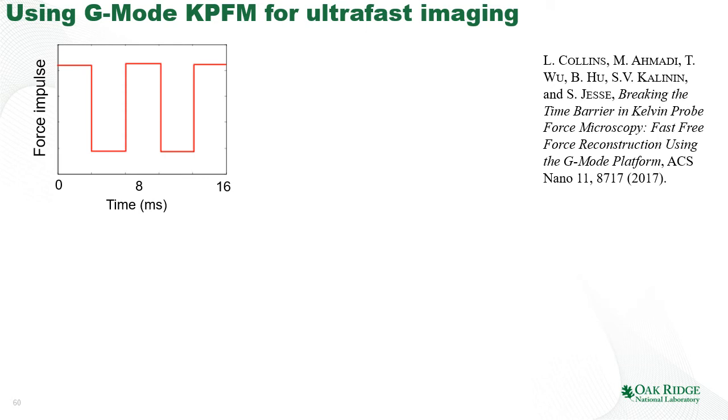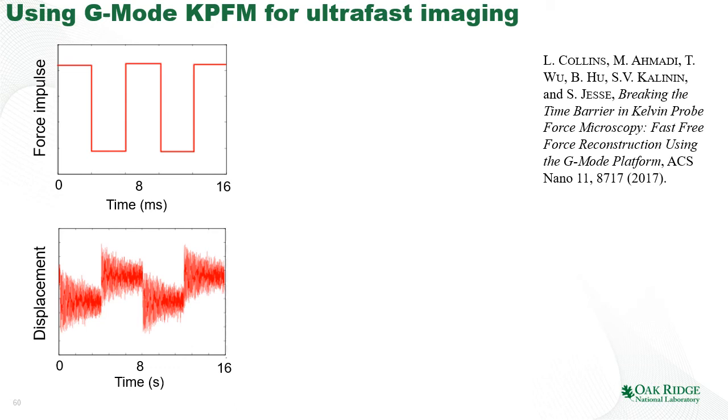And the reason why we want to do that is that in many material systems, it is the time responses that are ultimately interesting. And the problem is, why can we not measure it in the usual KPFM measurement? The answer is because of the cantilever ringing. So if our force pulse applied to the tip looks like this, our response of the cantilever looks like this.